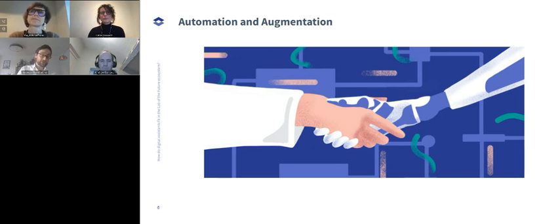Yeah, thanks for that question, because I think it's not a coexistence, but a necessity that you have both. The point is, if you have more and more automation going, nowadays what I see in the industry are things that I call automation islands. What do I mean by that? That might be a liquid handling platform with some connected analytical devices. It might even be several of those automated devices with a conveyor belt or an arm connected somehow.